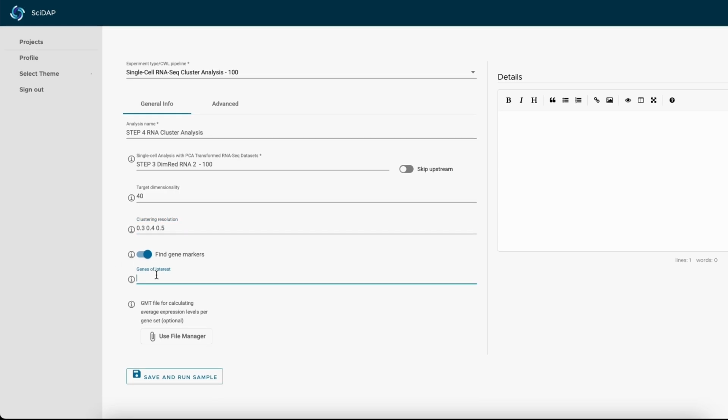Fine-tuning markers is a very useful option for manual cell type annotation of the clusters. You could type any genes that you think are helpful for this purpose. I will put just a few. Let's also put CTLA4.